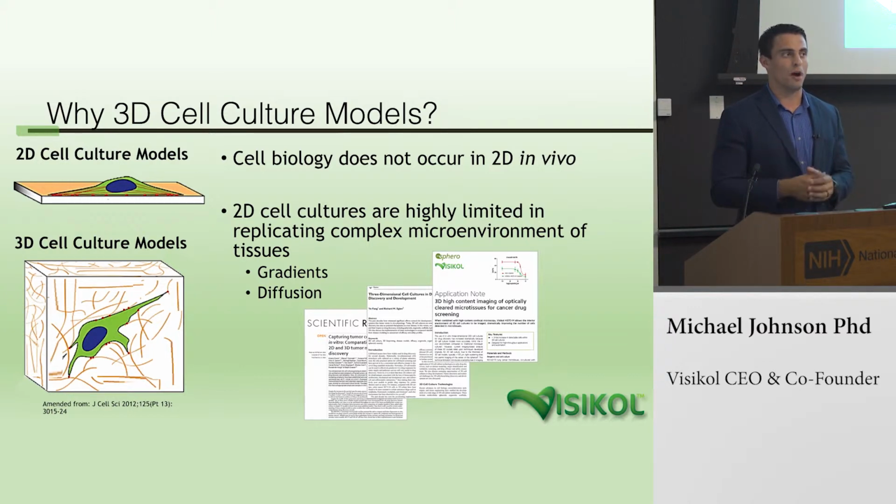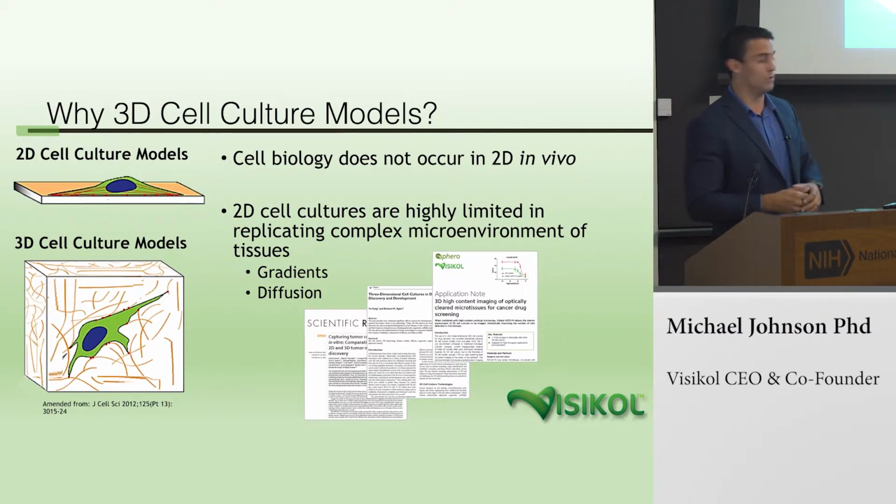So 2D cell culture models have many applications, which I'll talk about, but 3D cell culture models are coming into a whole bunch of different fields. In the last 5 or 6 years, they've gone from a very basic research application, a few publications really focused in academia, to at the forefront of drug discovery and being adopted by numerous pharmaceutical companies.